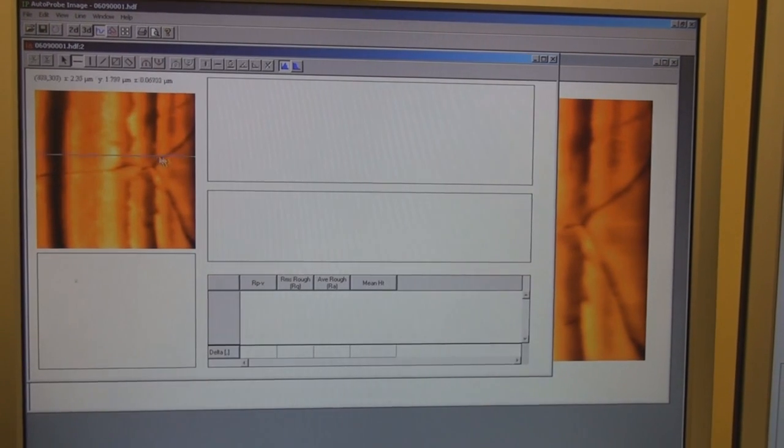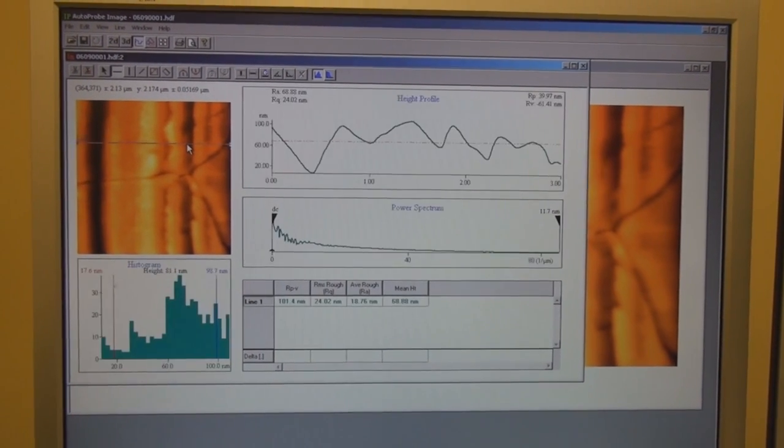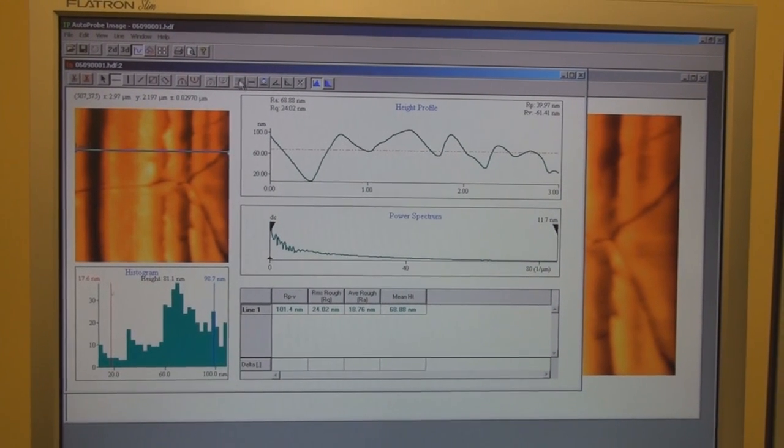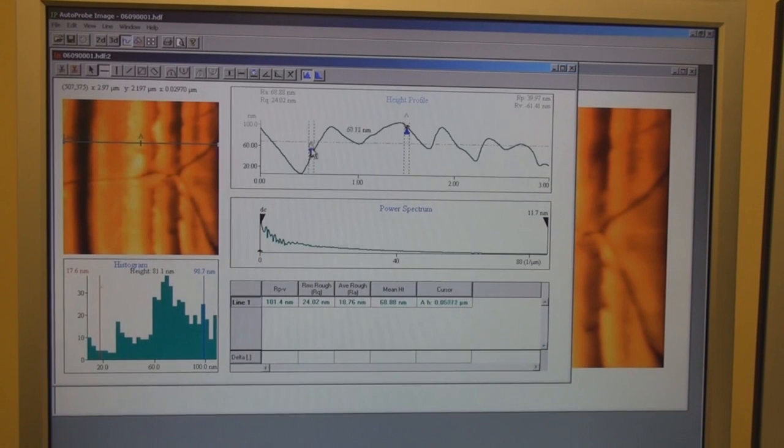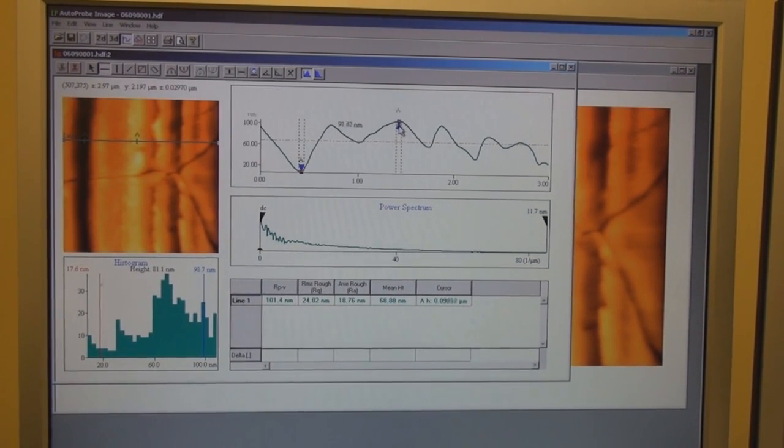The data analysis program makes it very easy to study the sites of interest. First, a line is drawn across the studied surface detail, and then the height and width can be measured by simply selecting the start and end point.